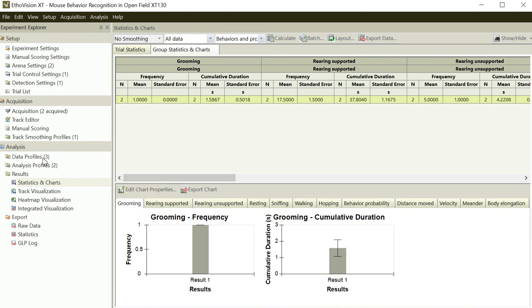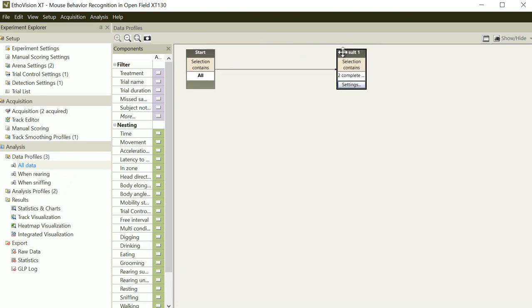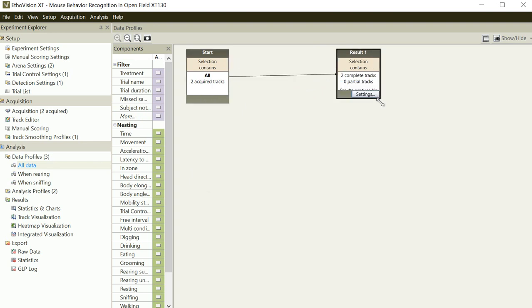So in this case, we are going back to the data profile. So I will try to make it quick. This is already 1 hour. They're too short and too long. So this is a data profile, and here you can determine which data should be treated how.